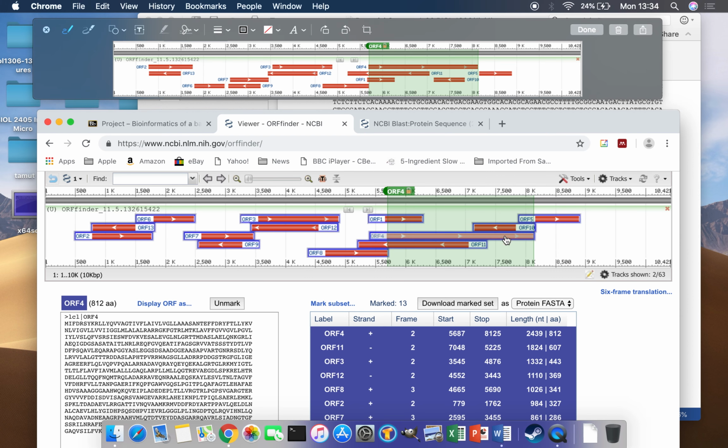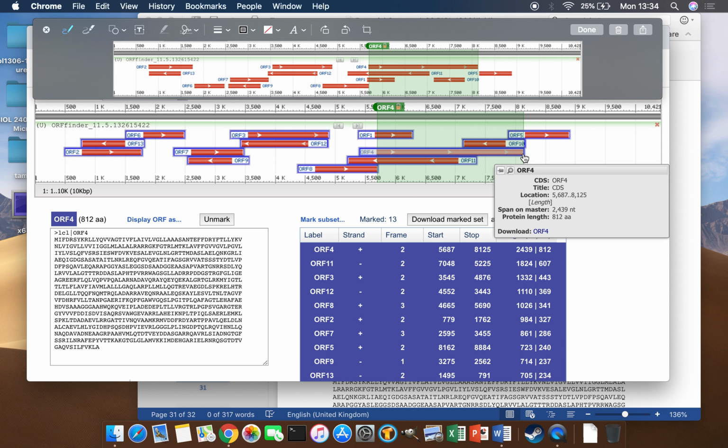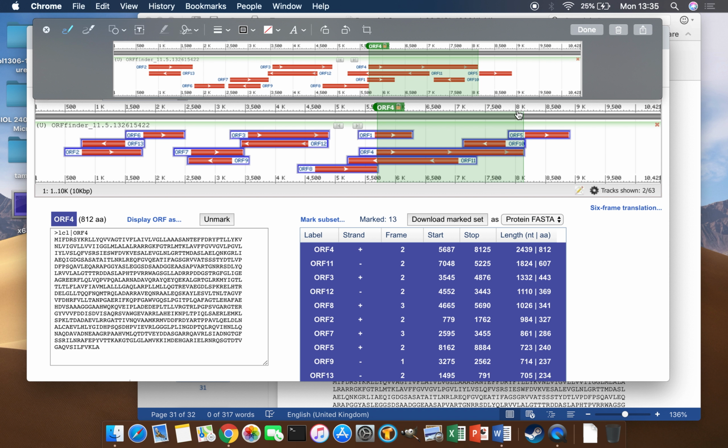Open Reading Frame 4 is bigger, and bigger usually means better in open reading frames anyway. You're less likely to get a big gene occurring by chance. Something that looks like a small gene can just happen randomly because there's only 4 bases, A, C, G, and T, and eventually you'll get an A and a T and a G next to each other that looks like the start, and eventually you'll get a stop at the end of that. And the stuff that's in the middle may not actually be important, and the bacteria may not actually make much of it. But here we go.